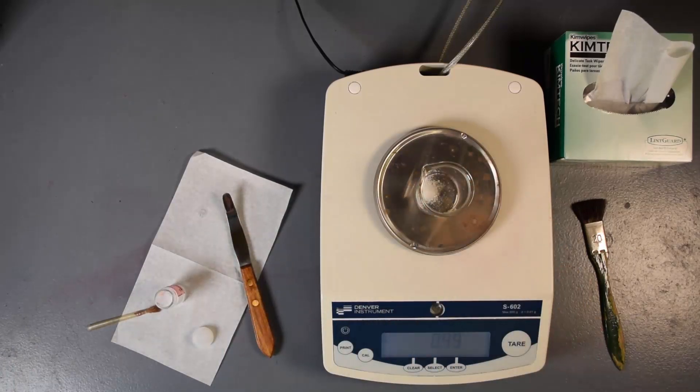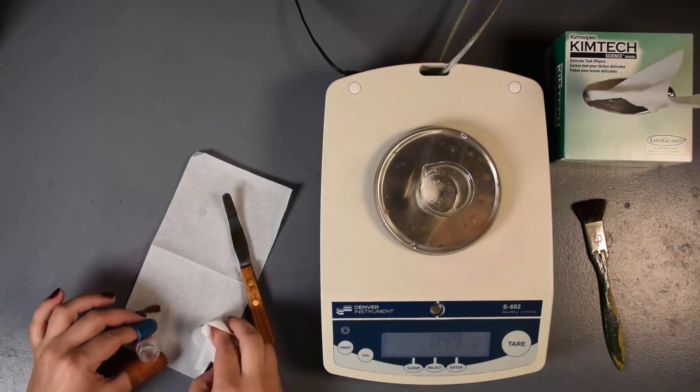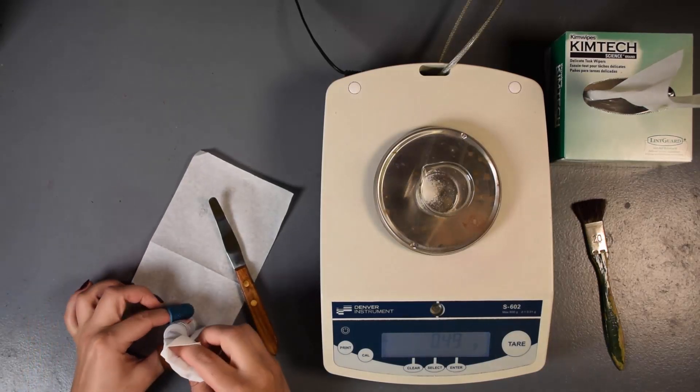Reweigh the beaker on the top loading balance. Once the desired amount is achieved, take your materials back to the analytical balance, making sure to not touch the container with your bare fingers.